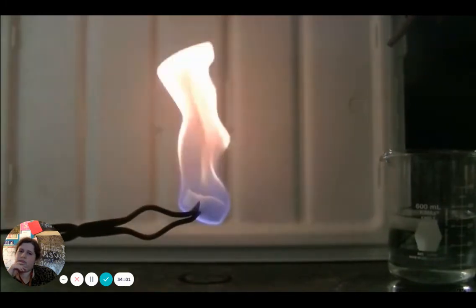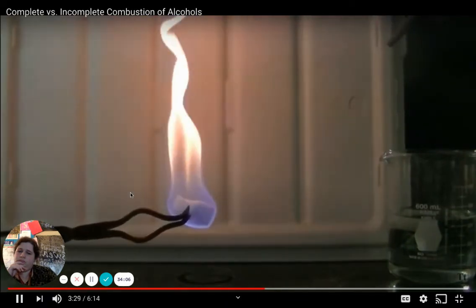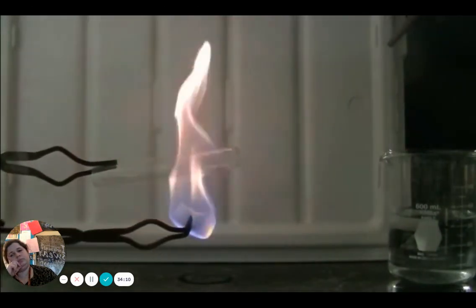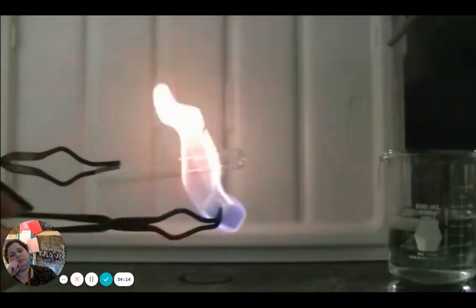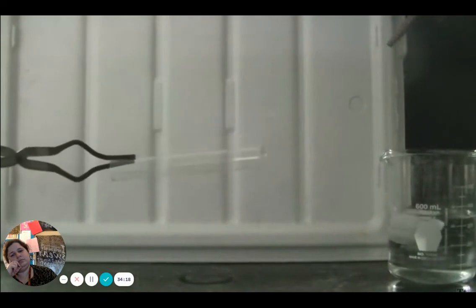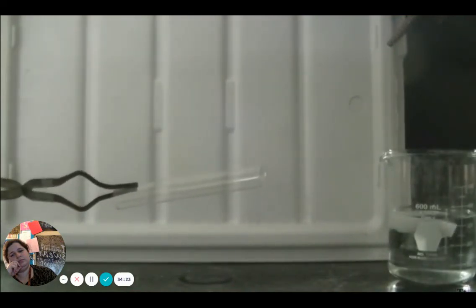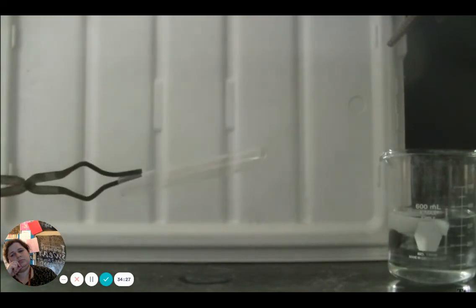Once again, we can do the test tube test to look for the formation of soot. And what we recognize is that even though the flame was quite yellow, there's not much evidence of soot formation.